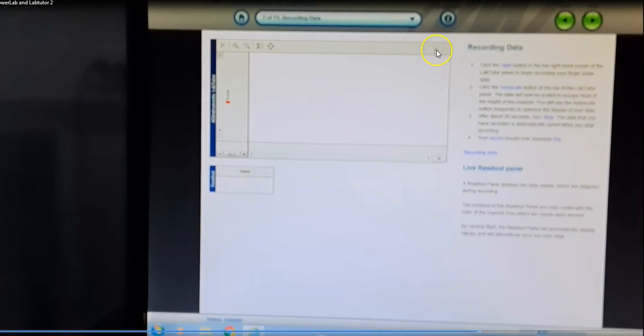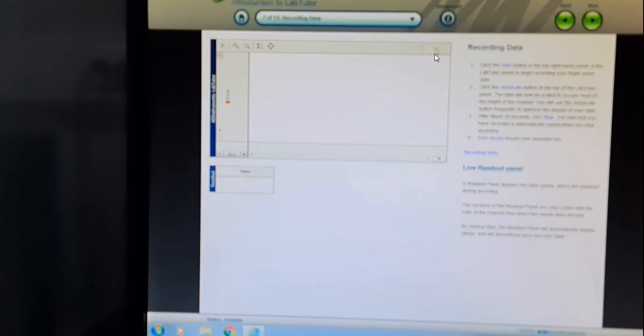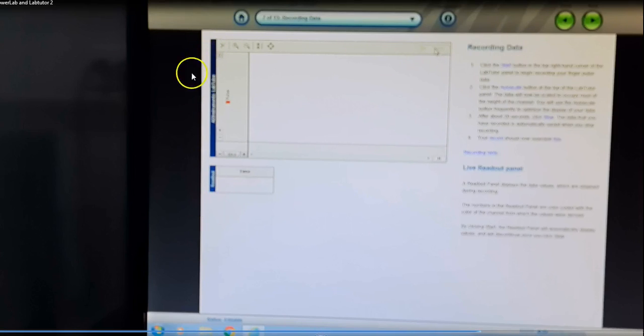As you can see there, I just clicked the start button. After you have attached the transducer to the pad of your fingertip, you turn on the isolated stimulator on-off switch, and then we focus on the software. You would now be able to see a value panel. The upper box will show you the waveforms generated by the pulse coming from my fingertip. And below here, you will see the timer of how long the recording has been happening.